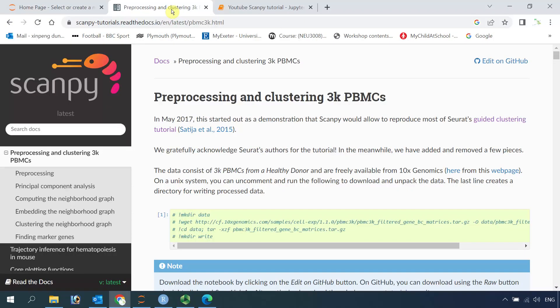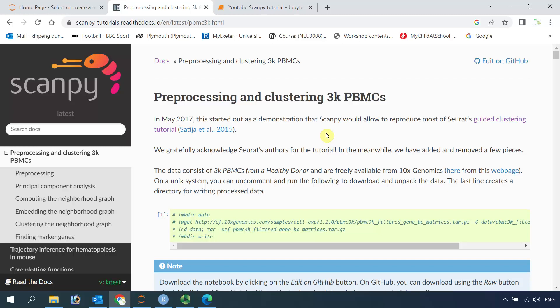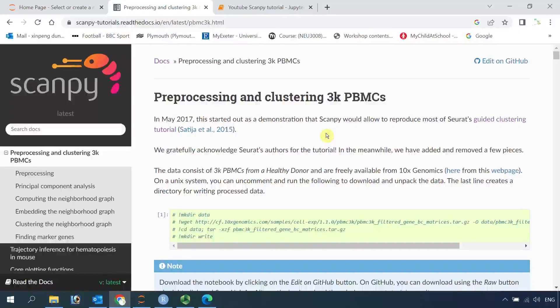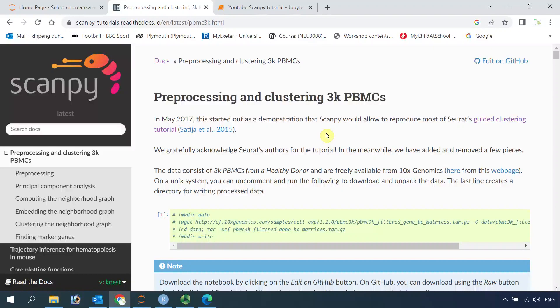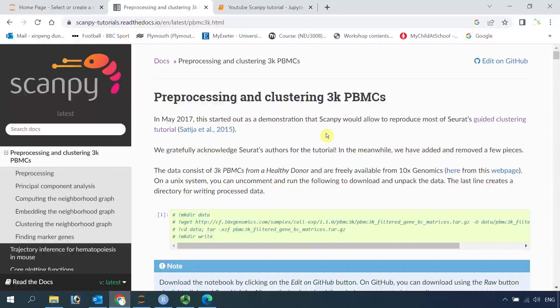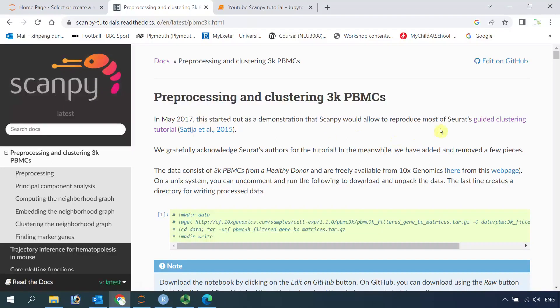Hello everyone, welcome to my Scanpy tutorials. I am an R and Seurat user, but when I started to do more of my data analysis, I found that lots of new tools were developed for Python. So I started to learn how to use Scanpy for single-cell RNA sequencing data analysis. Today I am going to show you how to do single-cell RNA sequencing data analysis using Scanpy. Scanpy was developed based on Seurat functions for analyzing single-cell RNA sequencing data in Python.